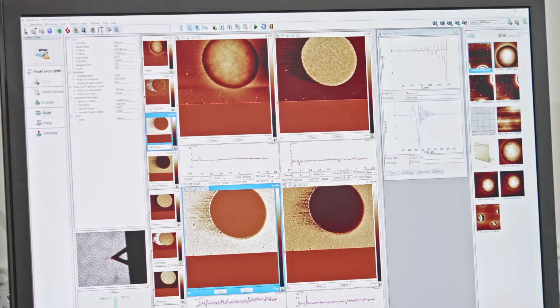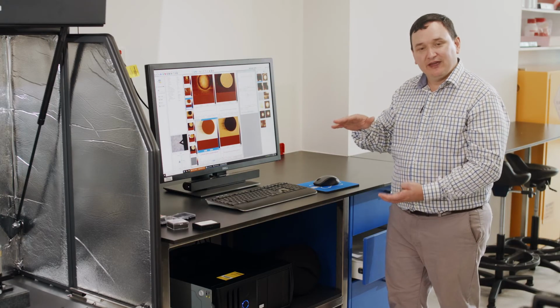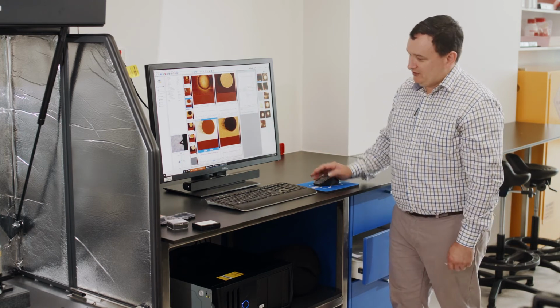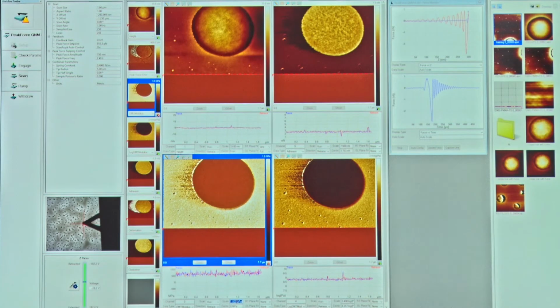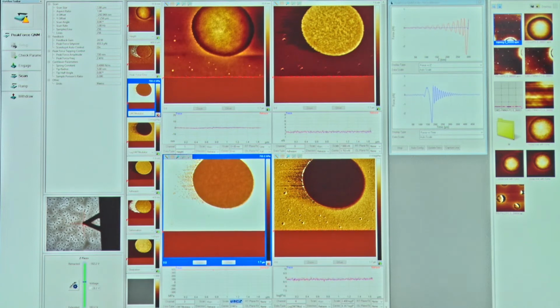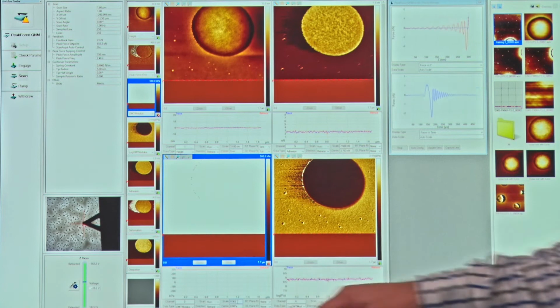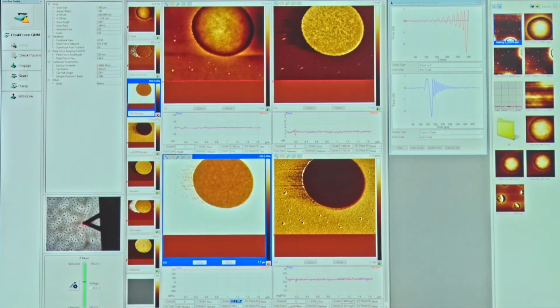The scale is the amount of data around that center position that we're going to render to this window. So I'm going to change this one here to maybe, let's see, if it's 1 gigapascal, maybe 0.7. Okay. Let's just change this offset a little bit to be maybe 0.2.